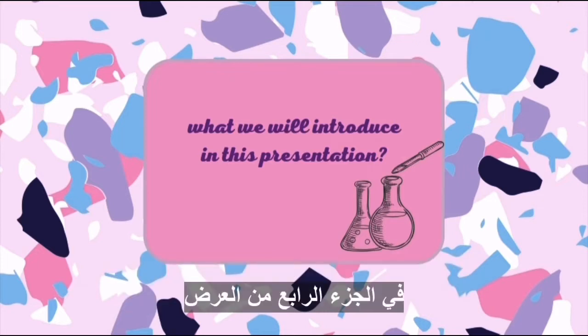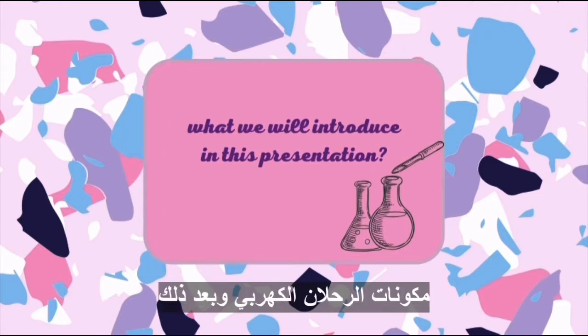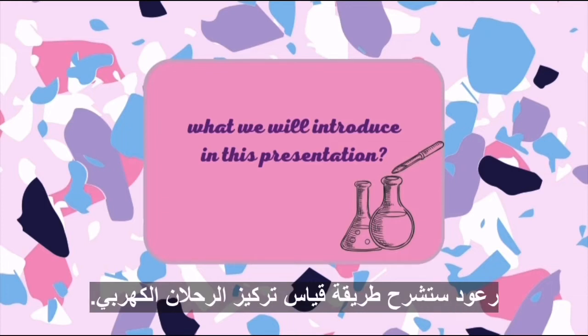techniques. In the fourth part of the presentation, Rod will talk about electrophoresis components, and later on Rod will explain the method to measure the concentration of electrophoresis.